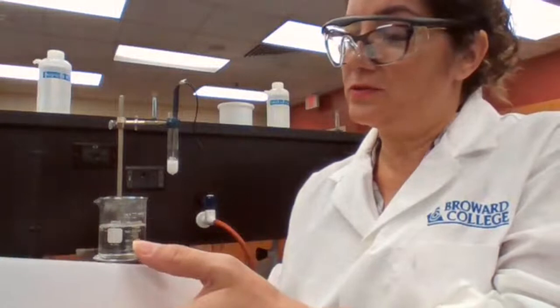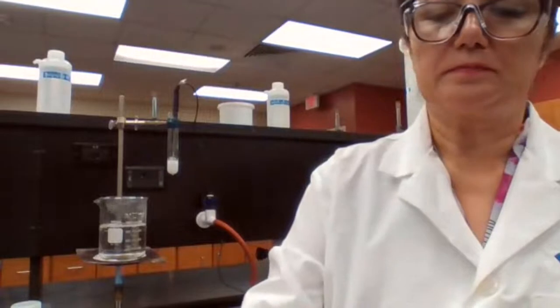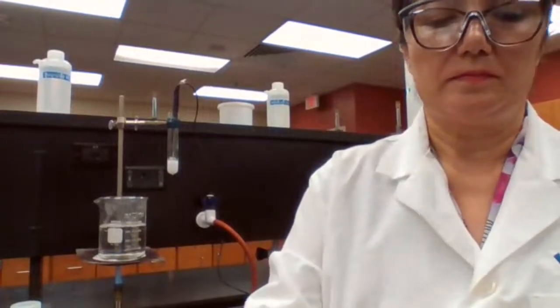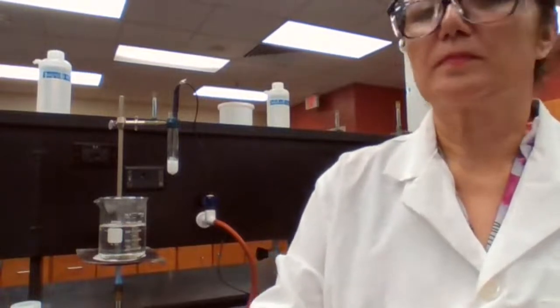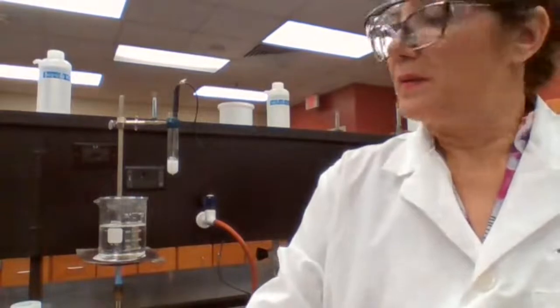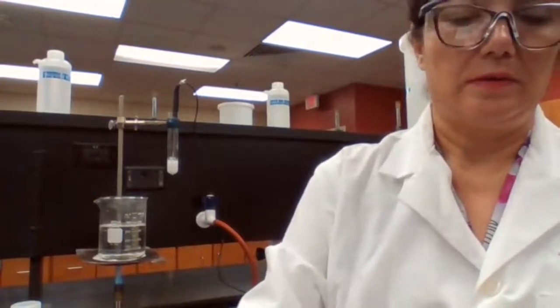Freezing point of benzophenone, 51.8. Let's see. Okay.